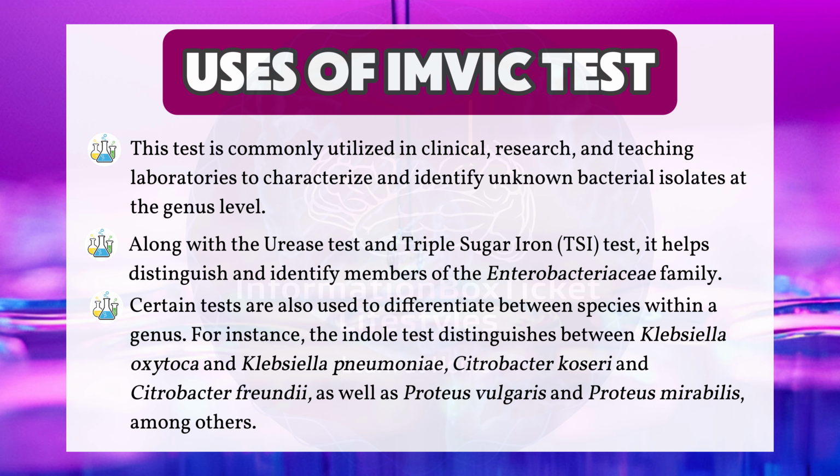Certain tests are also used to differentiate between species within a genus. For instance, the Indole Test distinguishes between Klebsiella oxytoca and Klebsiella pneumoniae, Citrobacter koseri and Citrobacter freundii, as well as Proteus vulgaris and Proteus mirabilis, among others.